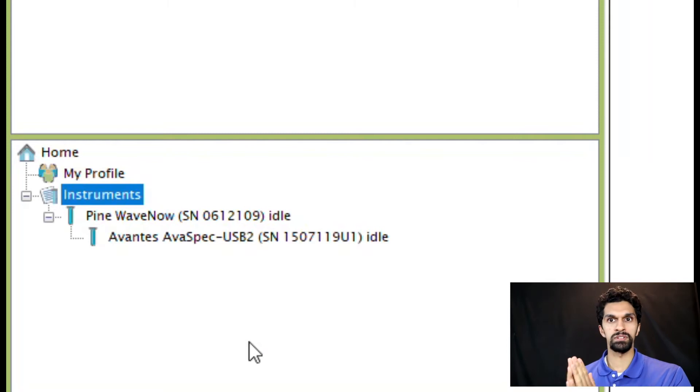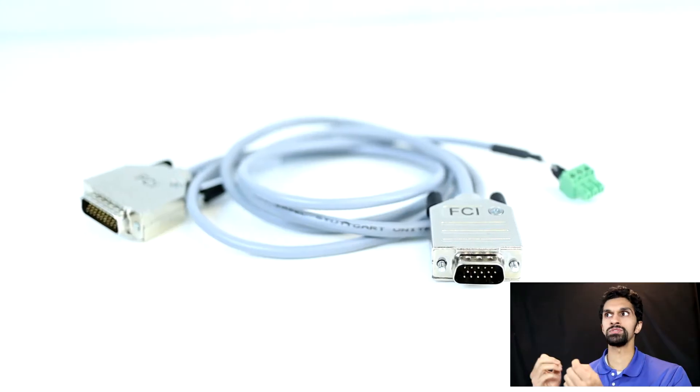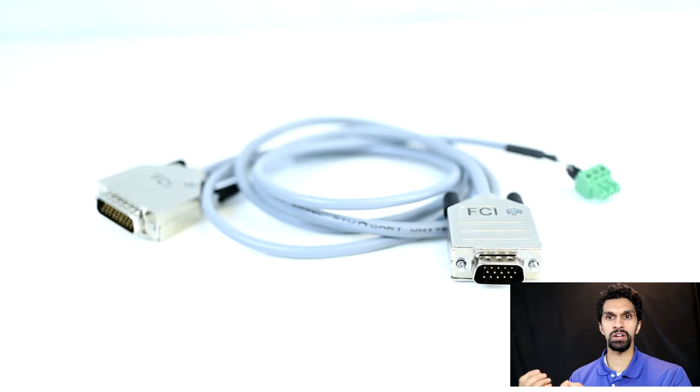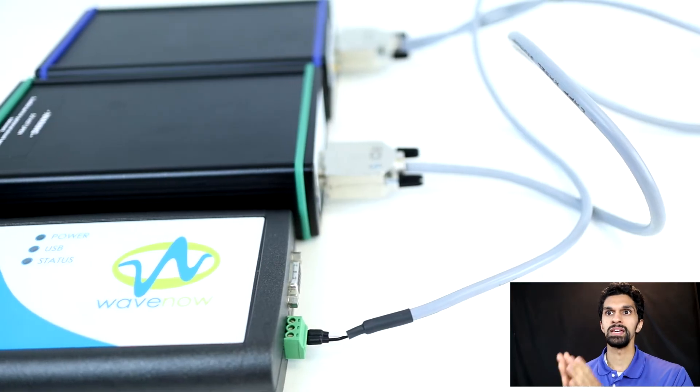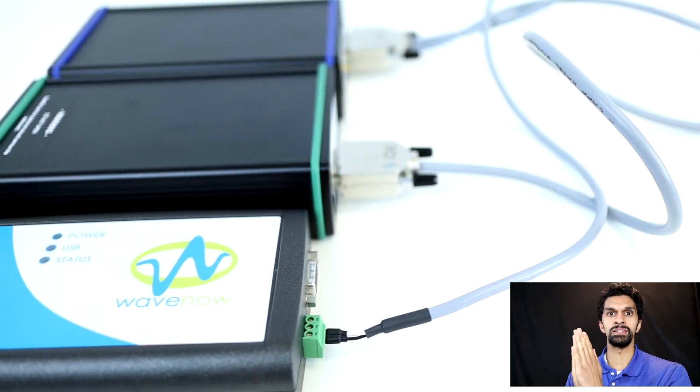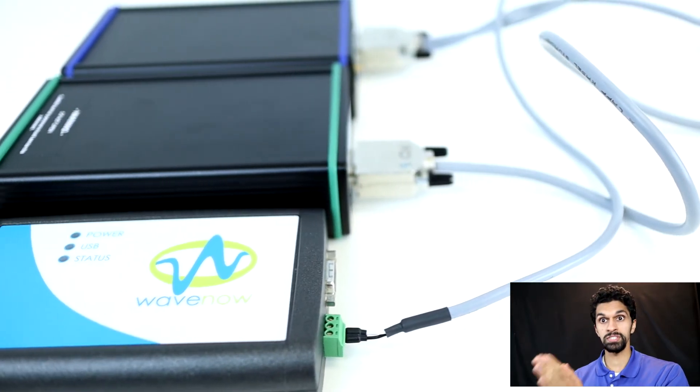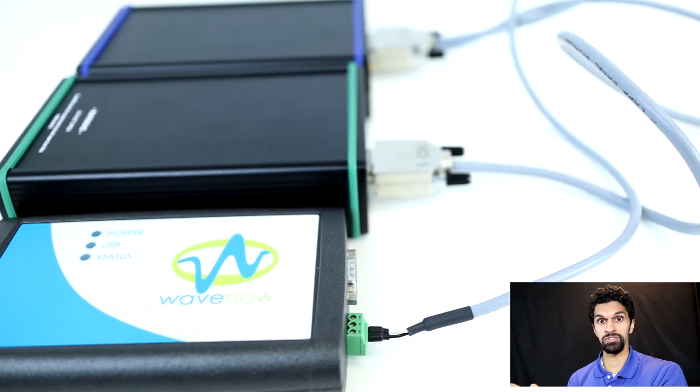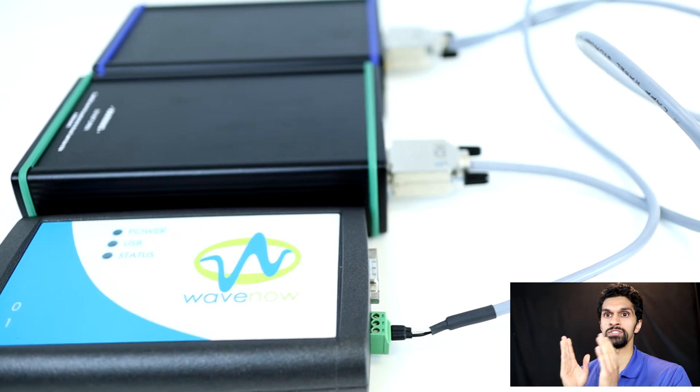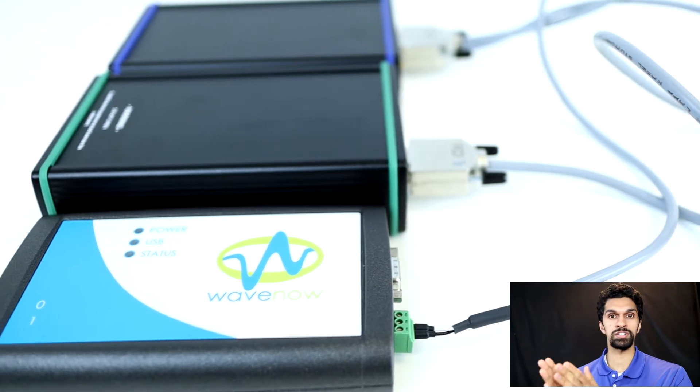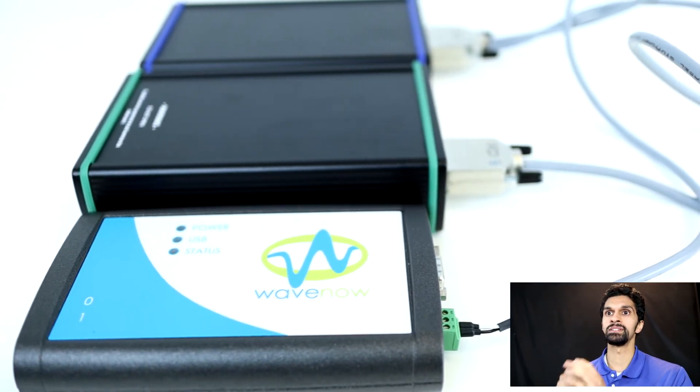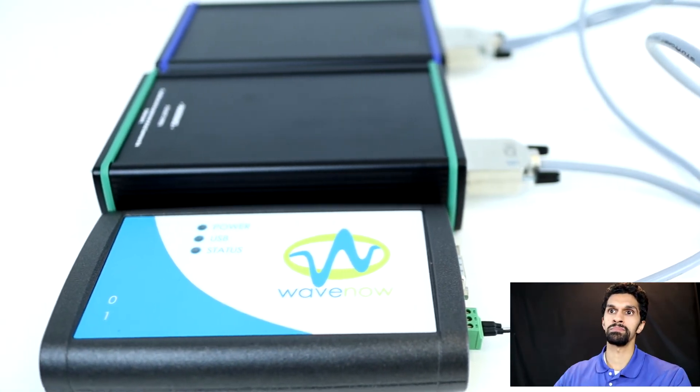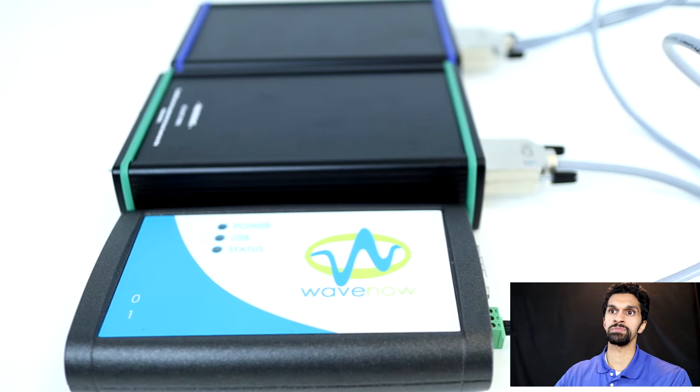Remember from part one, you will need to have the integration cable connected to the WaveNow potentiostat and the light source and the spectrometer. As long as the integration cable is connected and the potentiostat and spectrometer are nested, you will be able to do spectroelectrochemistry experiments.